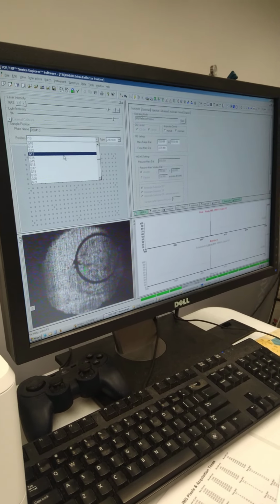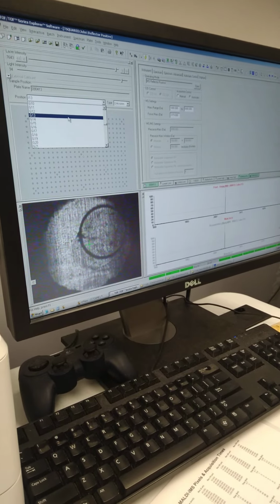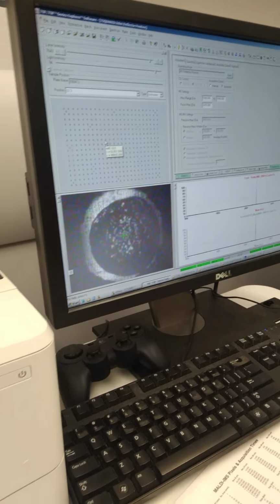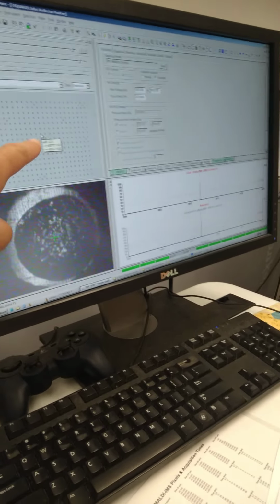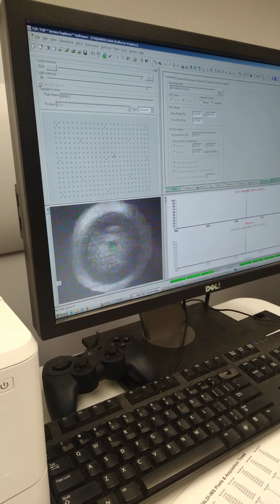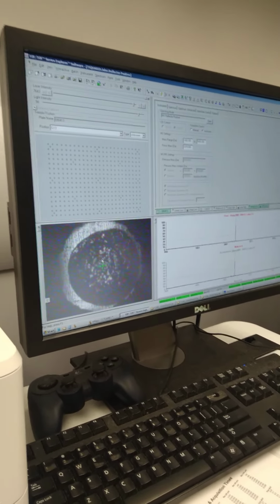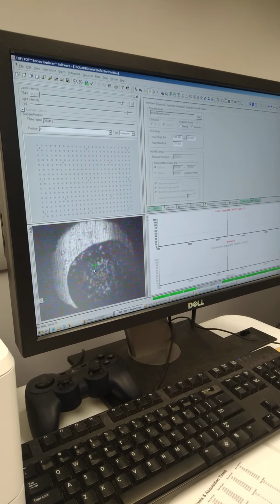Controlling the AbSciex software, first thing to do is navigate to your spot, the position tab here, or you can click on the spot itself. You can just click on the next spot if you wanted to move over to the right, and it would move over there, or you can move back. And then practice double left clicking and walking around, so that's just a double left click. Then you walk around without firing the laser.